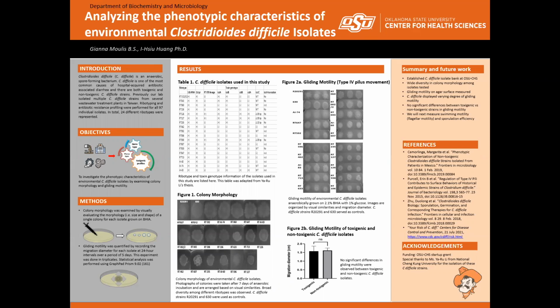Previously, our lab collected environmental C. difficile isolates from various water sources in Taiwan, such as wastewater treatment plants. This is significant because it marked the first time that C. difficile had been isolated from a water-based source in Taiwan. Genotyping, ribotyping, and antibiotic susceptibility assays were performed for all isolates.